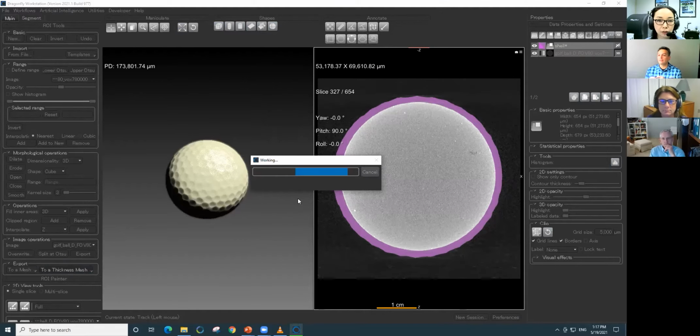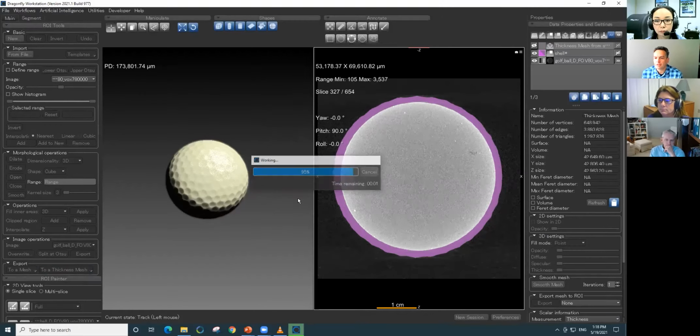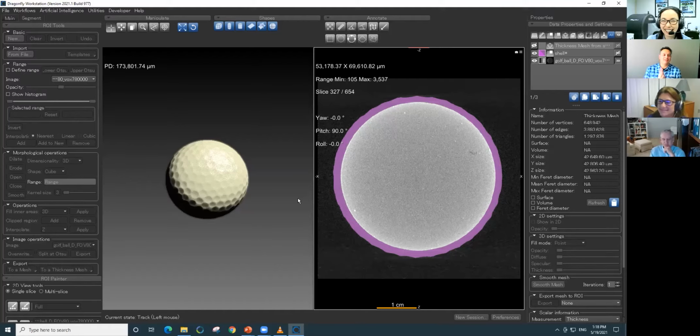And take questions. So while that's going, Aya, we've got a couple of questions come in here, and one has a follow-up. So let's start with that while we have a moment. The first question from Catherine was, can the user set the mesh size or element size in Dragonfly to control the level of resolution of the contour mesh and thereby control the resulting final file size written by Dragonfly? I'll let Mike take that question. He will answer that better. Knew that was coming.